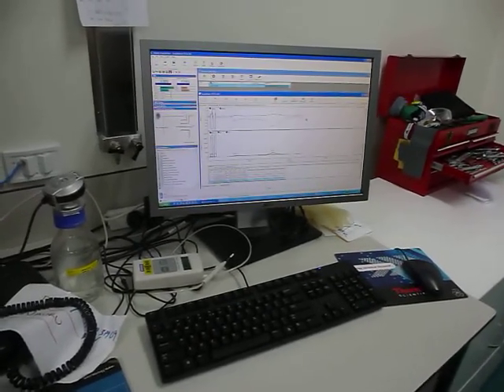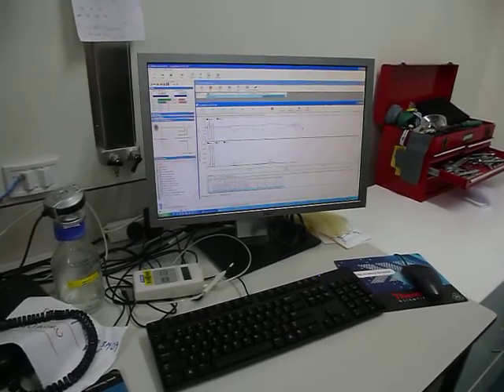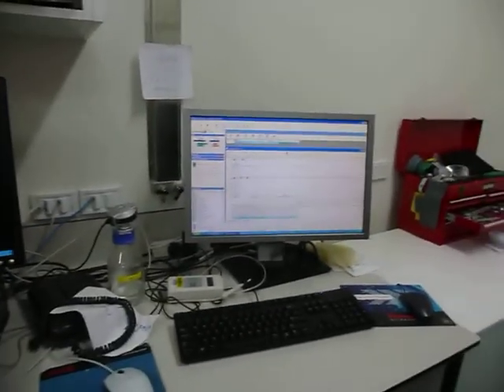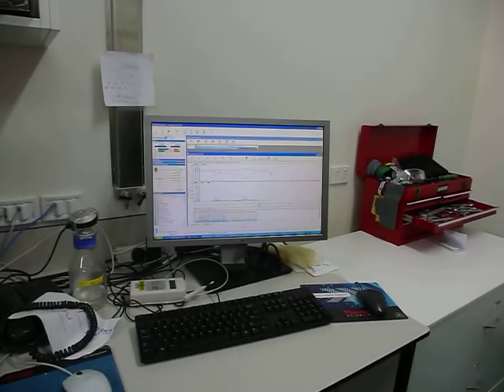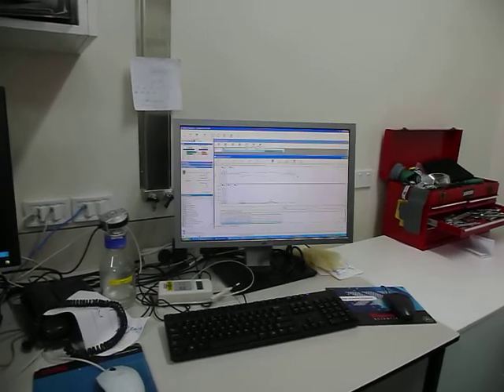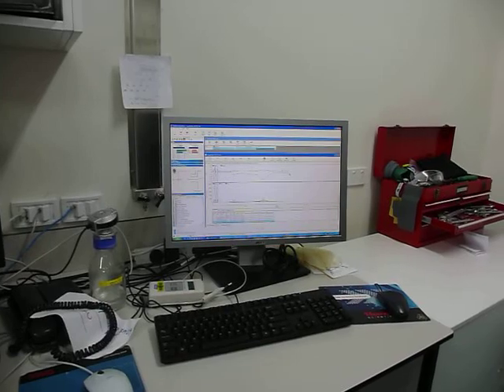So you see, the computer has no one operating it. It's all controlled by scripting. AutoIT is a scripting language, and it enables the control of different software in synchrony, and this can be very useful to control different instruments also in synchrony.